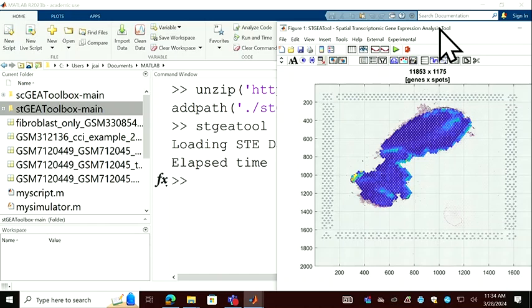Oh, you have a different picture? Oh, okay, yes. Yeah, if you load this, you get that. But if you use example data, you get, yeah, either way. You just click OK. So this is example data I had already prepared for you to show the tissue and also those gene expression spots. Yeah.